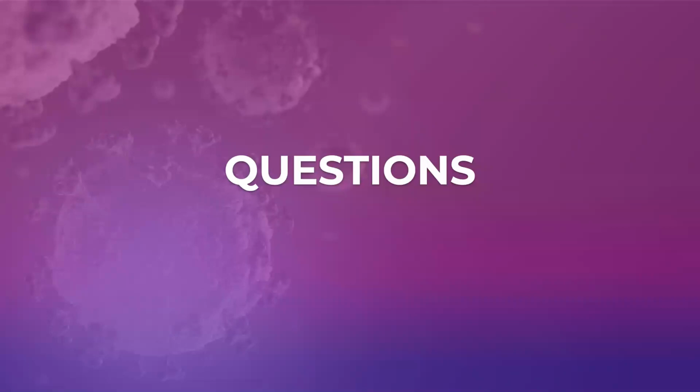Okay, Therese is asking, is there a general threshold you can use to determine that a certain number of reads is negligible, or should you look at it comparatively with other samples? Depends for what, right? And that's a great question. So we started talking about some of these variants, okay? One of the questions about variants is whether it is a variant that we are sure of or a variant that we are unsure of.